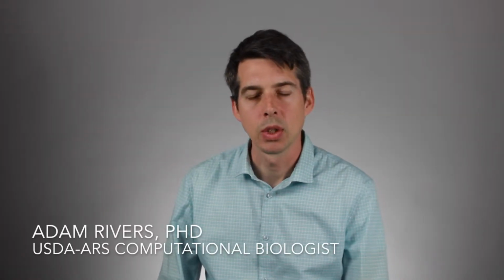I'm Adam Rivers, a computational biologist for the USDA's Agricultural Research Service. In this tutorial, I'll be explaining how to use amplicon sequencing and the software package QIIME2 to analyze fungal ITS sequences. Amplicon sequencing is a very cost-effective way to profile the composition of a microbial community.